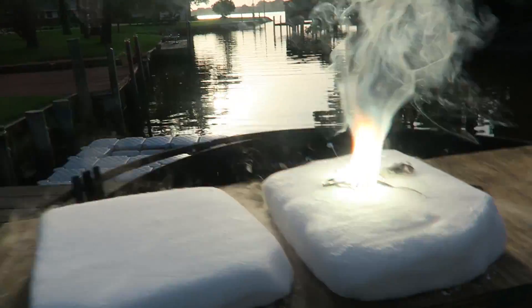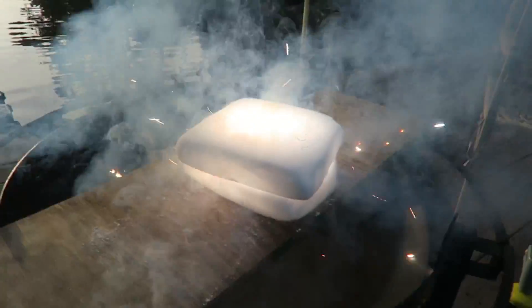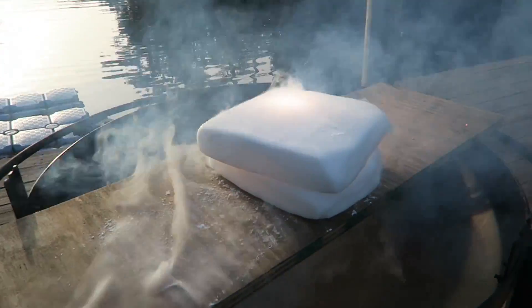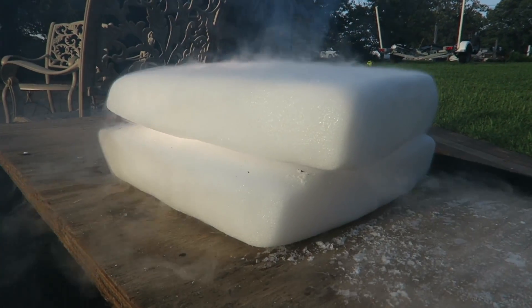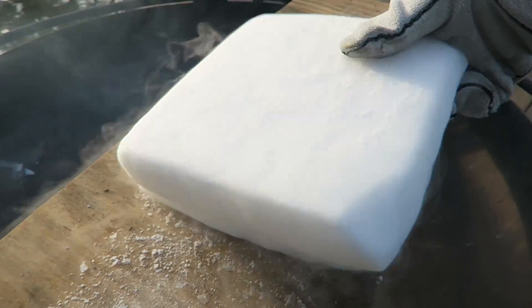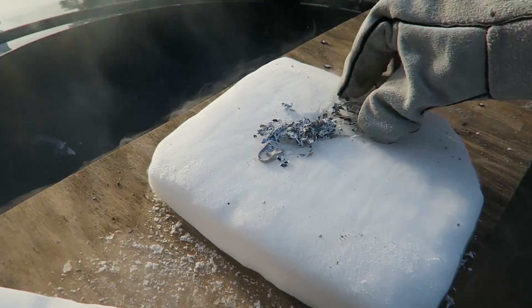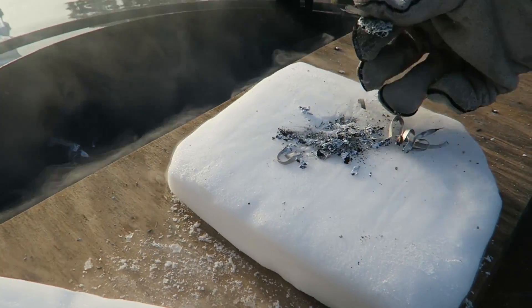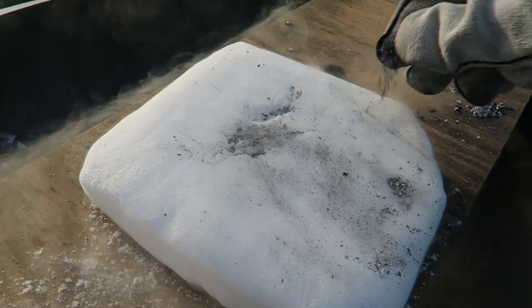As you can see, the magnesium ribbon is still burning even though it's under the dry ice — isn't that incredible? If you pull it off, look, it's mostly burnt out. Magnesium ribbon burns so hot that even dry ice does not put it out.